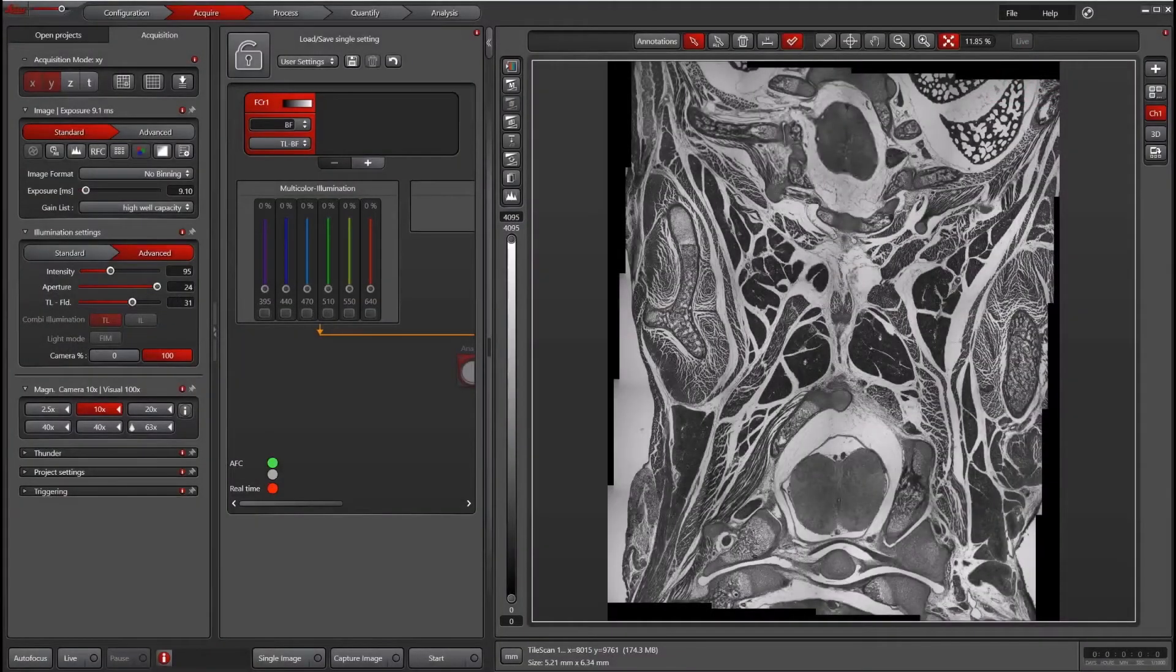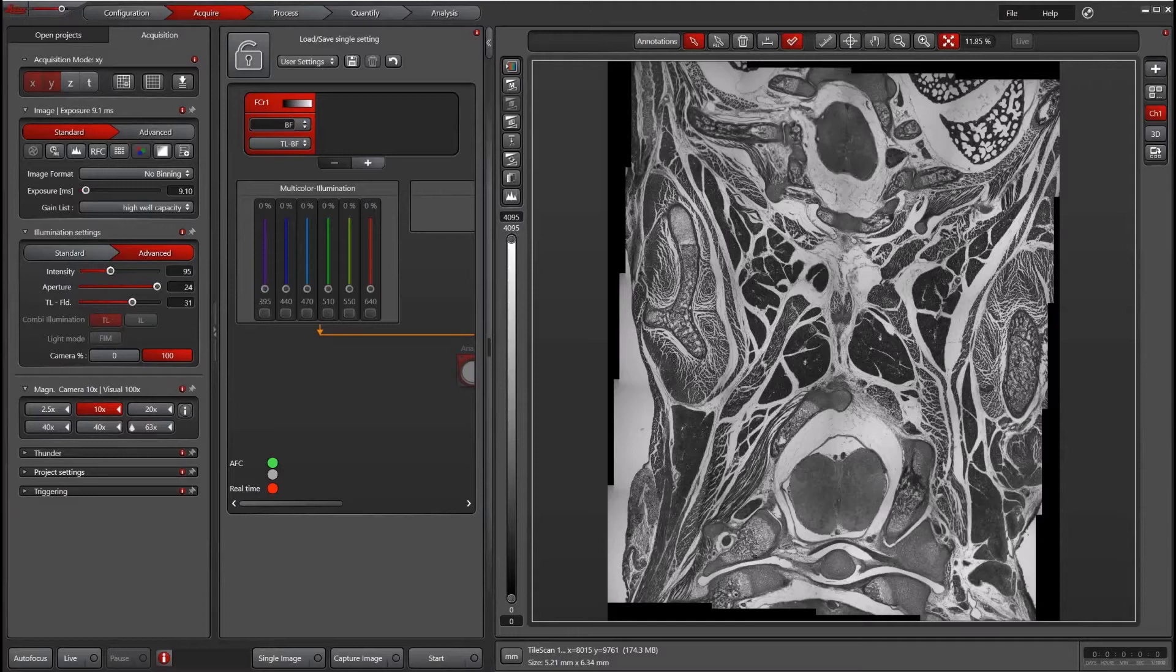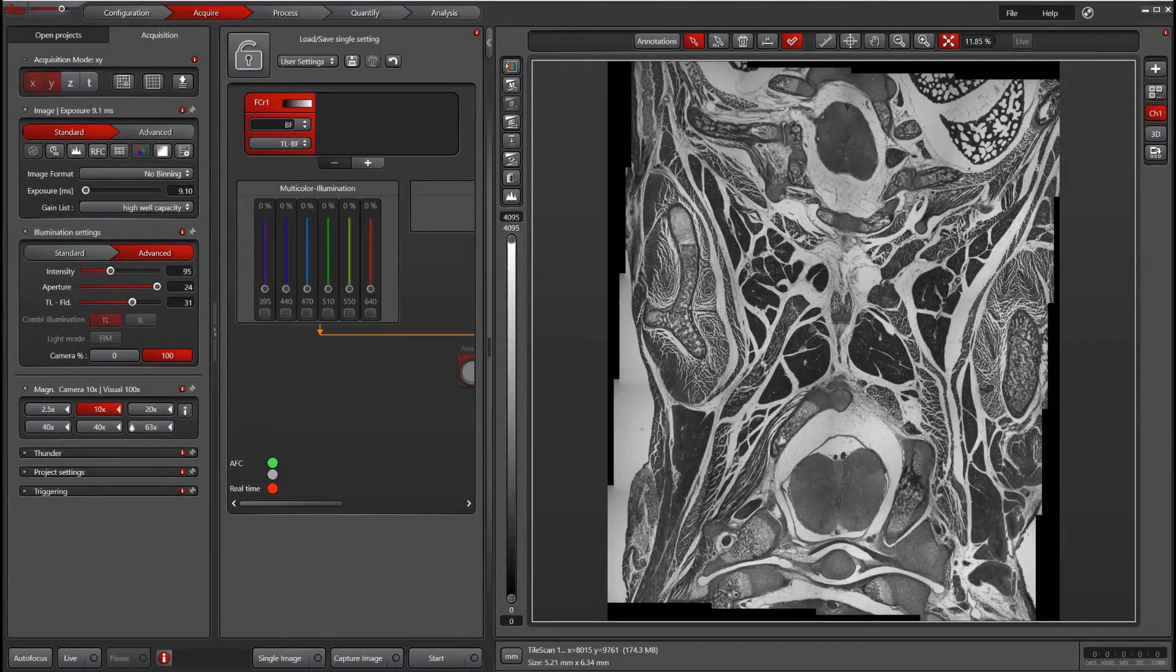So the goal of this video is to show you how to align the camera, and this is especially useful for tile scanning.